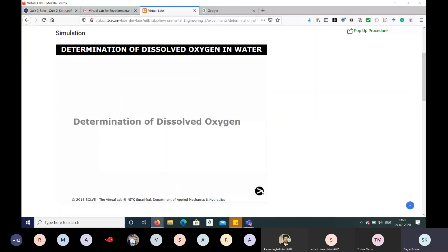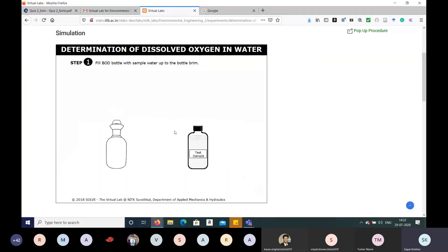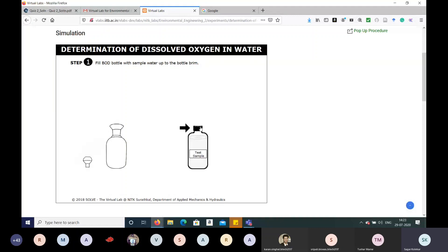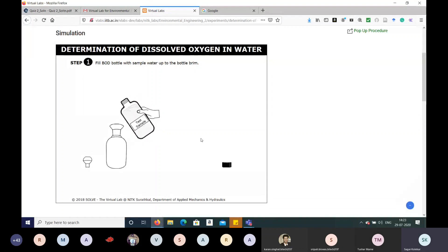Now we start the actual experiment for determination of dissolved oxygen. The first step is to fill the BOD bottle with the sample water up to the bottle brim. Remove the knob of the BOD bottle, then take the test sample and add it up to the brim.